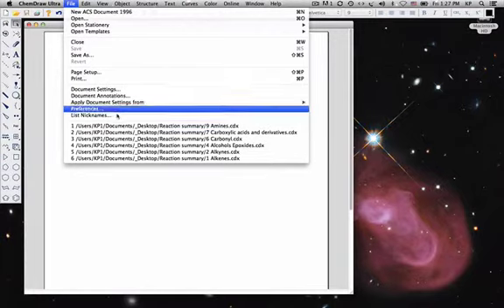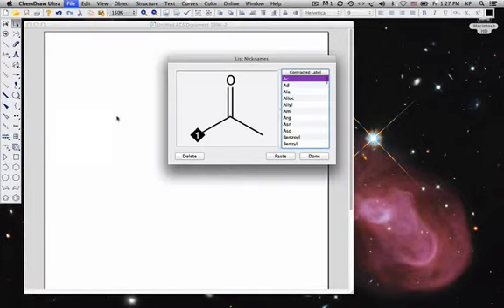One thing that we have not looked at is the nicknames. Many chemicals have abbreviations, and some groups have abbreviations as well. This is the acetyl group, and this is where it is attached to the molecule. And we can see that it's a carbonyl adjacent to a CH3. It is important to know what ChemDraw thinks these nicknames are, because if you use them, you want to make sure that it is compatible with what you're thinking that you're writing down.